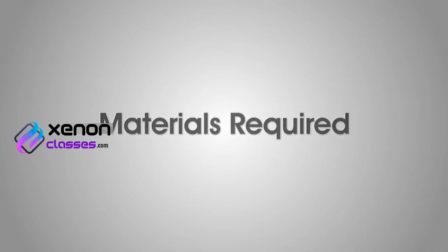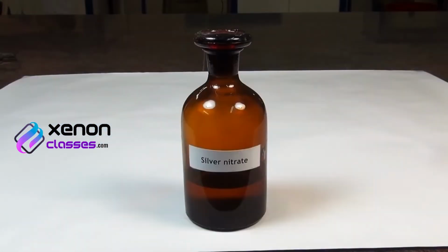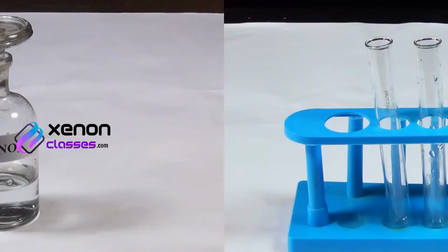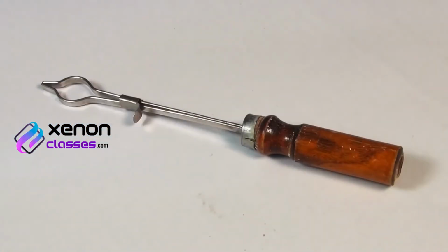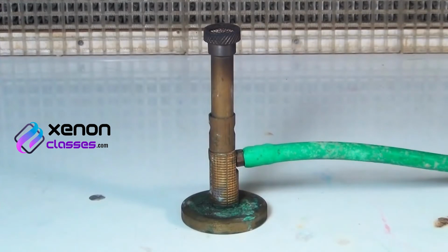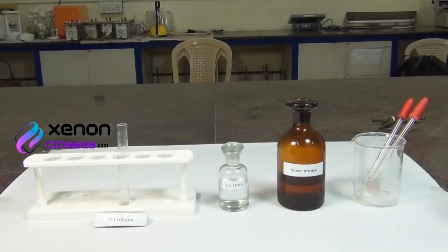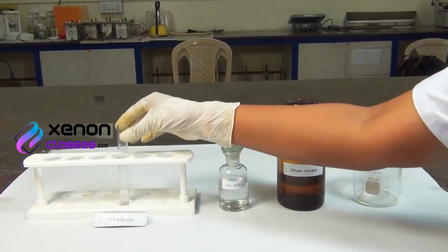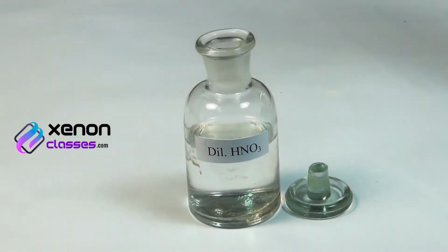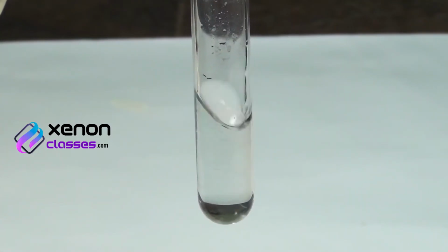Materials required: aqueous solution of the salt, silver nitrate solution, dilute nitric acid, test tube holder, droppers, and Bunsen burner. Procedure: take a portion of aqueous solution of the salt in a test tube. To acidify the aqueous solution, add some dilute nitric acid to it using a dropper.